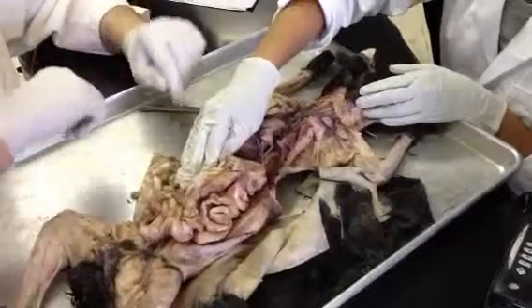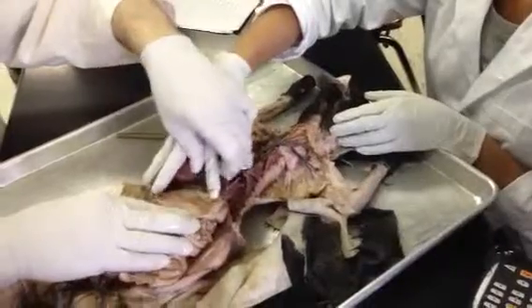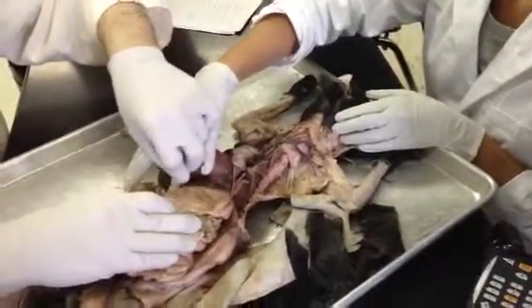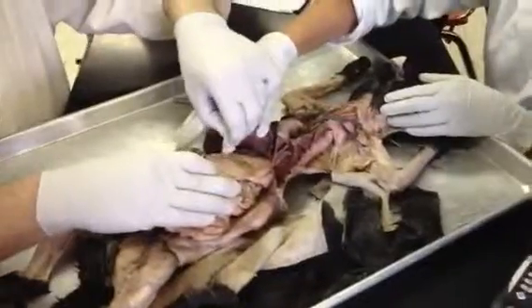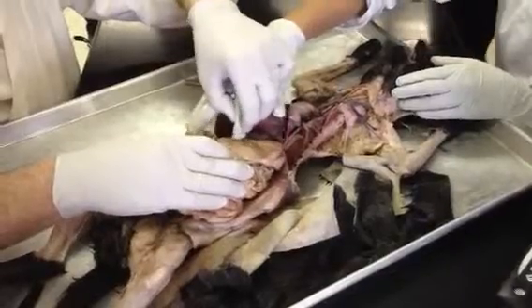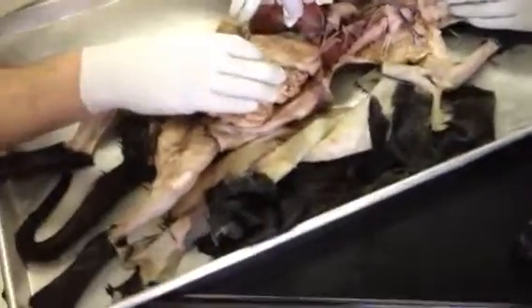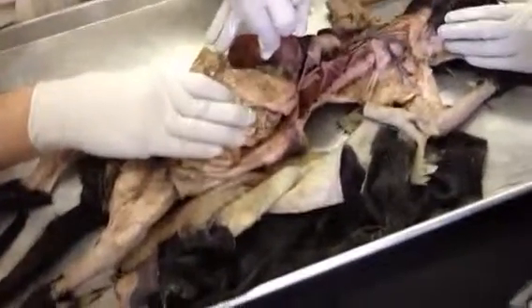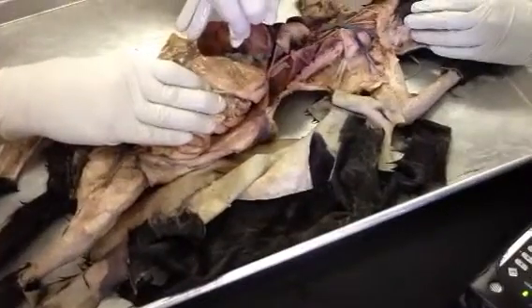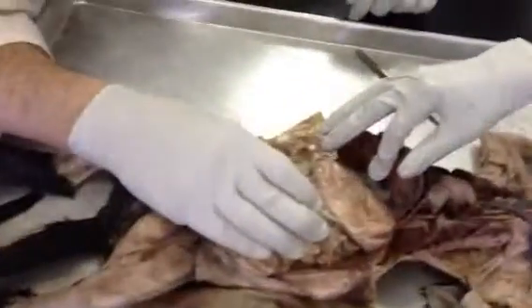Coming off the lesser curvature of the stomach. Let's go back to where the lesser curvature is. Here we go again with greater curvature to refresh your memory. There's greater curvature. Lesser curvature is a tight little inside curve, a concave curve. And there's a mesentery there, inside the lesser curvature, that connects the stomach to the liver. That's the lesser omentum. It's another mesentery, double layer of serous membrane, anchoring the stomach to the liver. That's greater omentum, lesser omentum.